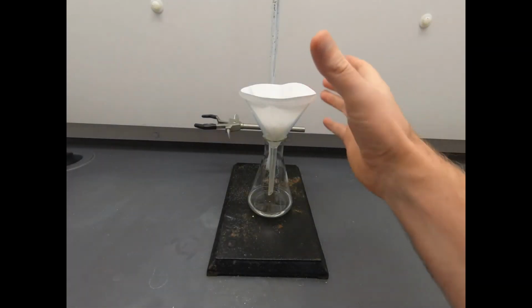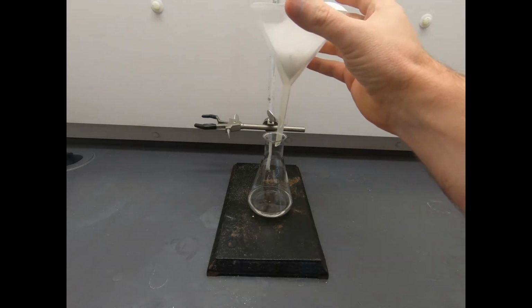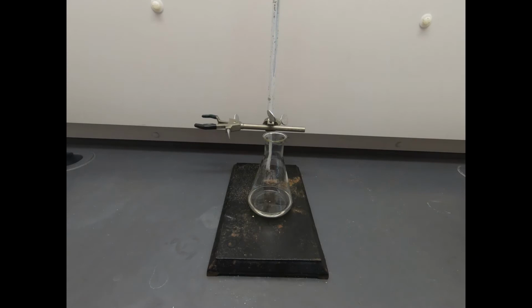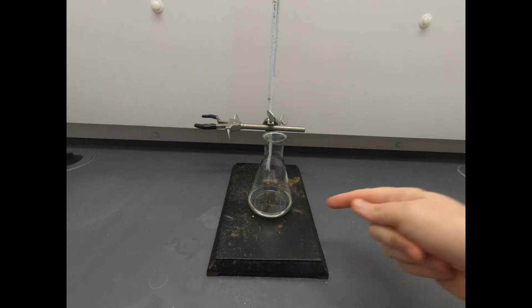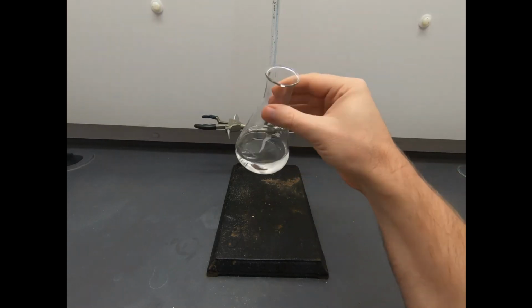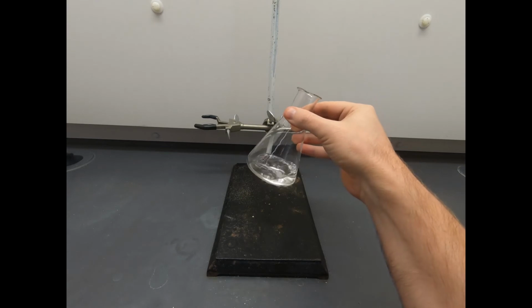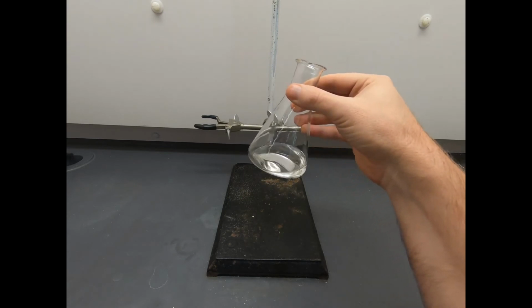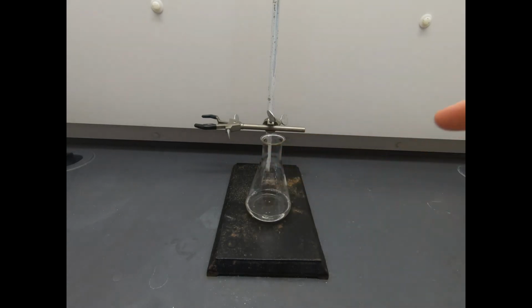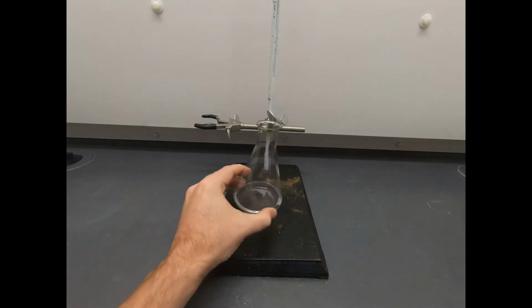So fantastic. So this has all filtered through. We have residual solid in there. This is presumably waste. We won't throw it out until we get our actual material isolated. But here is our aspirin dissolved in isopropanol and separated from the other salts and binders that you find in the pills. So now we need to get this material. We need to recover our aspirin from the isopropanol.